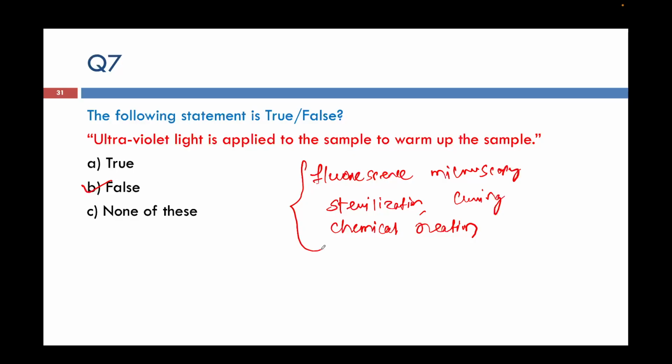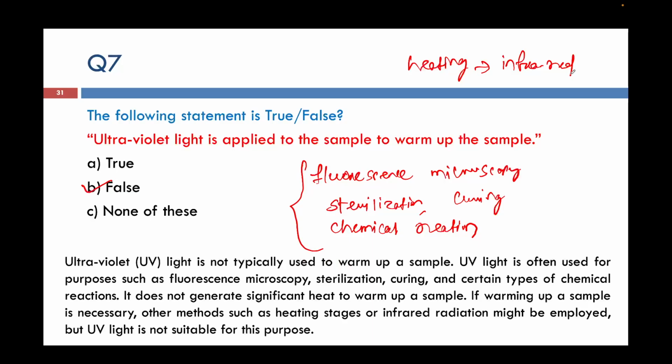It is not used to heat up the sample. Generally, to heat up the sample we use infrared. Okay, yeah, here I have written.